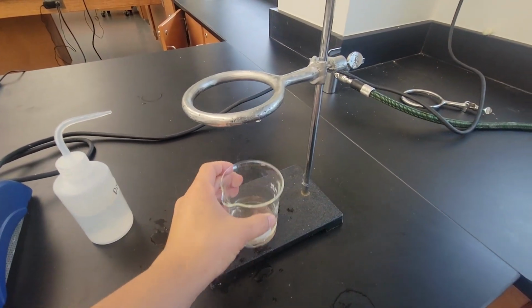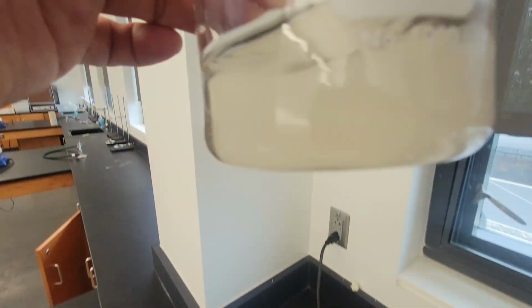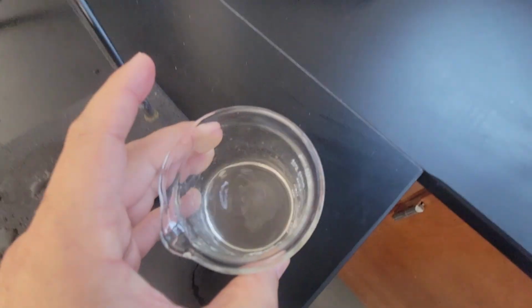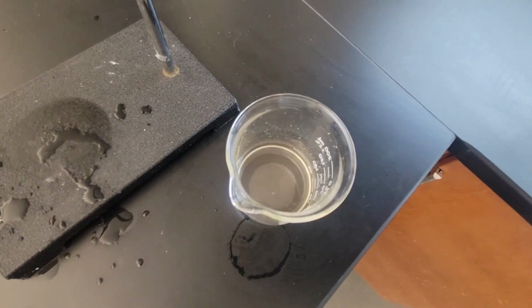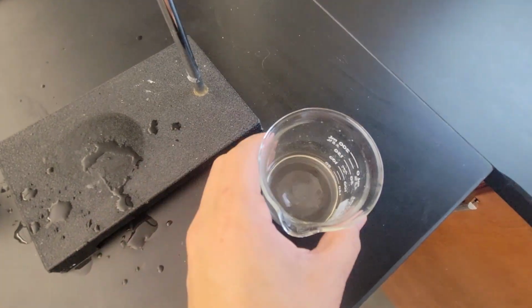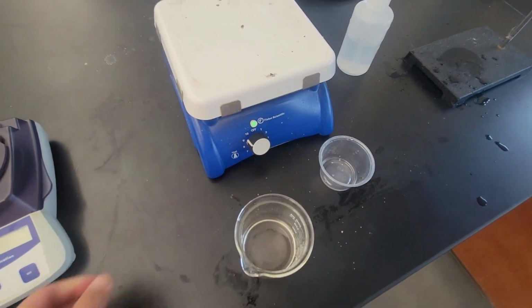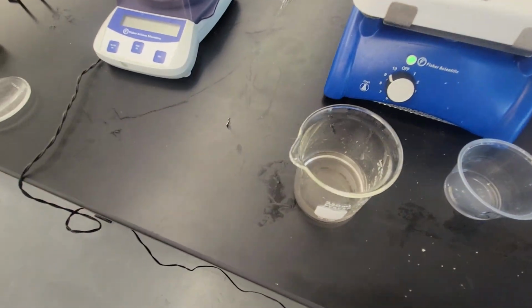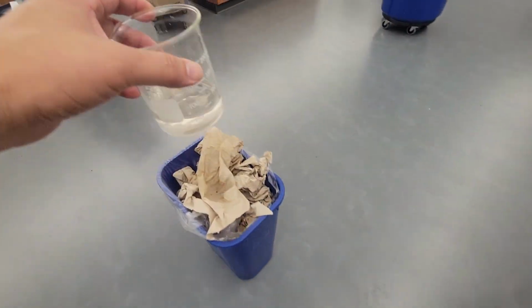Now back here with the salt water, there should be no sand in the salt water. Nothing. Just salt water. Now how do we separate salt from the water? Well, they have different boiling points, so we'll use distillation. Turn this guy on, and just make sure our beaker is dry so it doesn't crack.